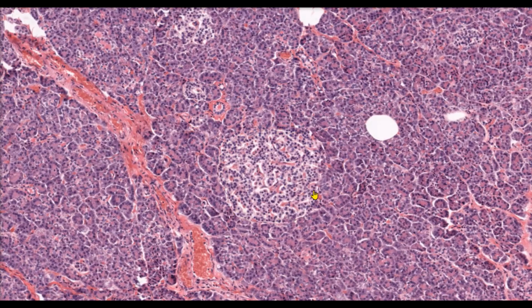Now, the pancreatic islets produce a number of different hormones. For this class, we're going to focus on the two most important. The two hormones we're going to focus on are glucagon, which increases the plasma concentration of glucose, and insulin, which decreases plasma glucose levels. There's other hormones produced in the pancreatic islet as well, things like pancreatic polypeptide and somatostatin, but we're not going to focus on those for this class.